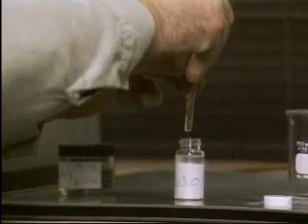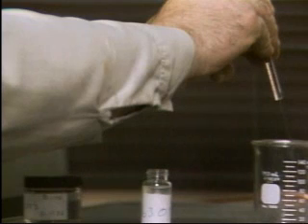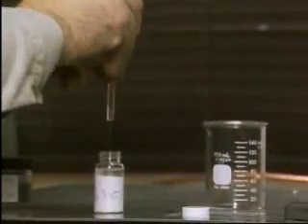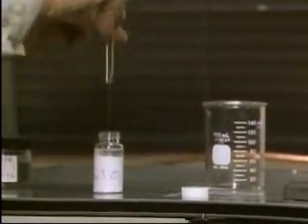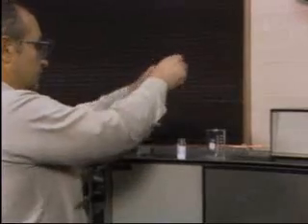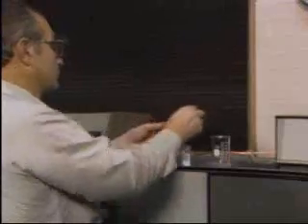A syringe is used to draw off a small amount of the sample, which is then discarded to waste. This procedure is performed several times to ensure that the syringe is free of any foreign materials that could contaminate the sample. Next, the syringe is filled, and then some of the sample is forced out of it to remove any air trapped in the syringe. The sample is then injected into the sample port.